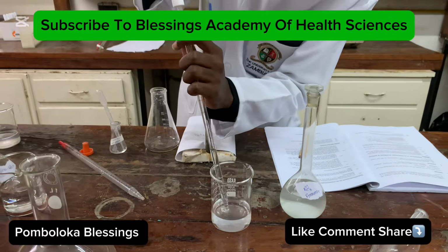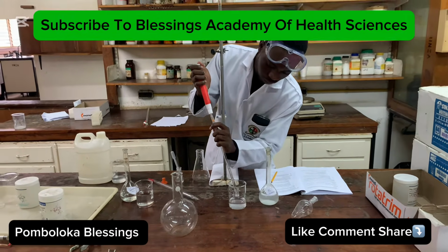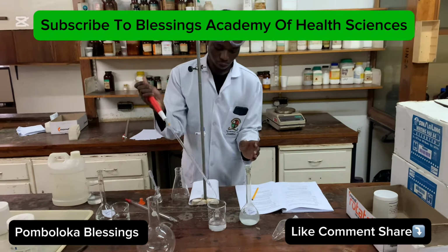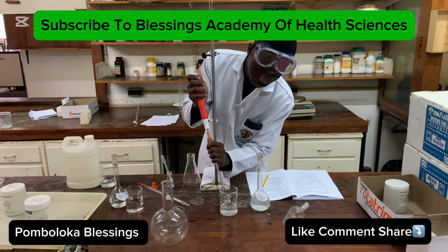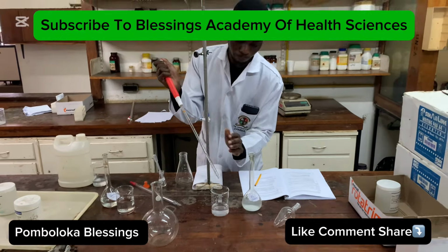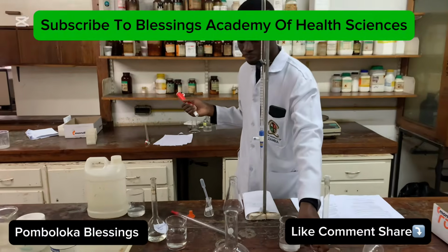We're trying to make sure we're as accurate as possible. So we're collecting 5 mLs of this. Collecting 5 mLs of ammonia.